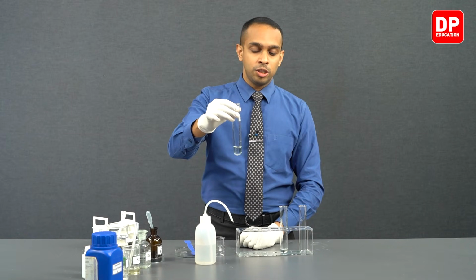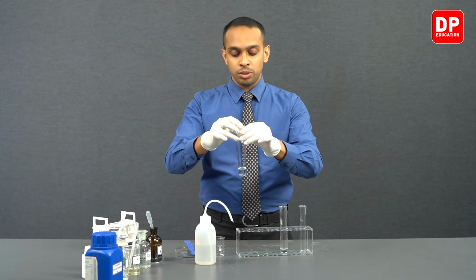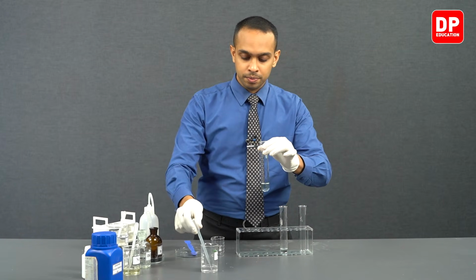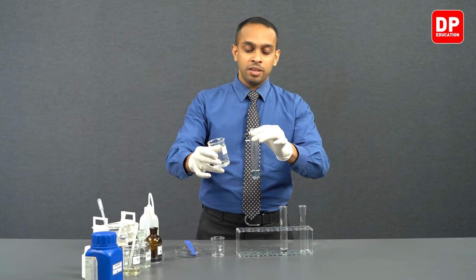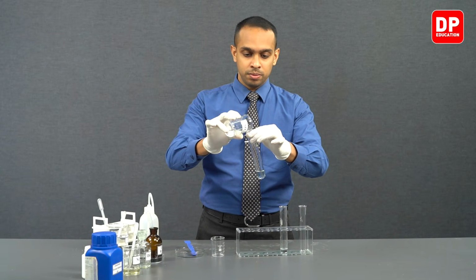And to this boiling tube, we will be now adding nitrate ion solution. We have our nitrate ion solution here. We will be adding about 2 cubic centimeters of nitrate ion solution to this boiling tube.